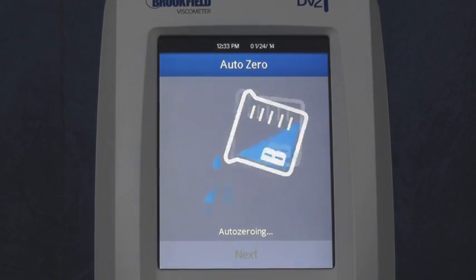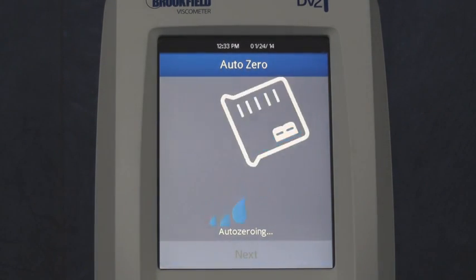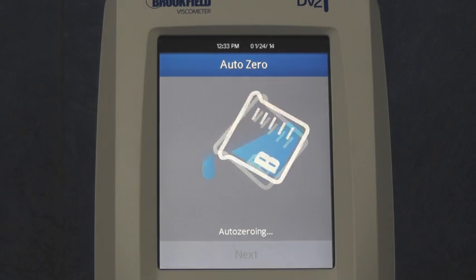If the DV2T viscometer is unresponsive to touch, then remove the screen protector and reapply.